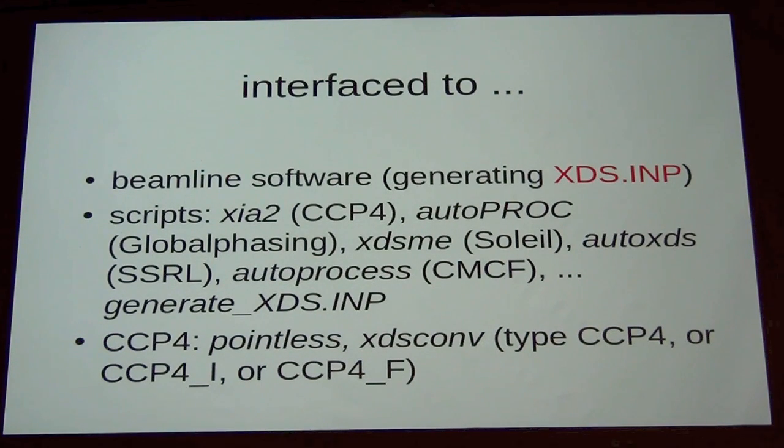It has a description of the experiment and also tells XDS what it should do. And XDS does not read the headers as other programs do. You have to provide XDS with the data that describe your experiment. And this is both good and bad. It is good because it makes XDS simpler. It's much easier to maintain something. It cannot break in this respect.